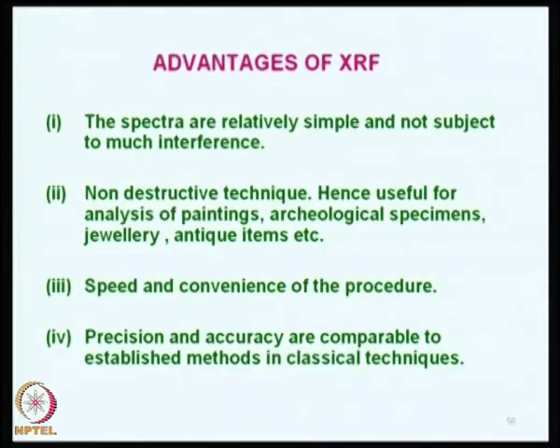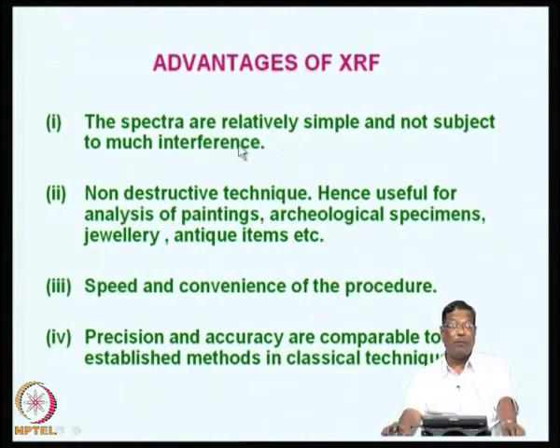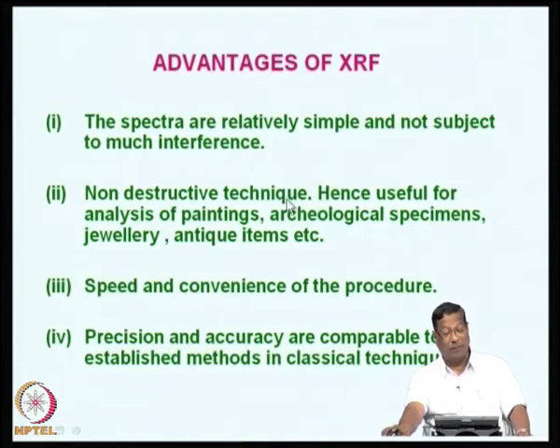So, what are the advantages of XRF? We can summarize it like this: the spectra are relatively simple and not subject to much interference. This is one of the important advantages, because there are not many complications, and with a little training one can do the analysis. And then basically it is a non-destructive technique. So, you are not going to lose any sample.